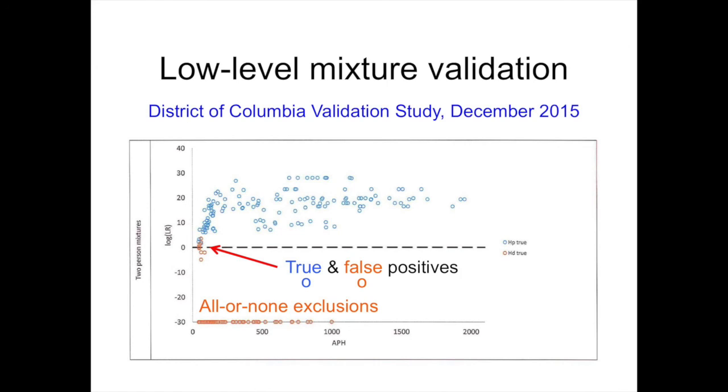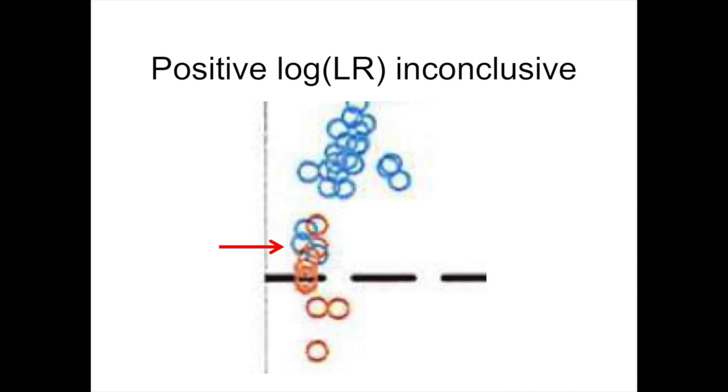It just says you could view that as exclusion or fail. For inclusion, it's very gradual. Here's just a rapid fall off. But this region, which Clint Hughes cross-examined one of the analysts on at some length, is worth a close-up, which is what was presented at the hearing.